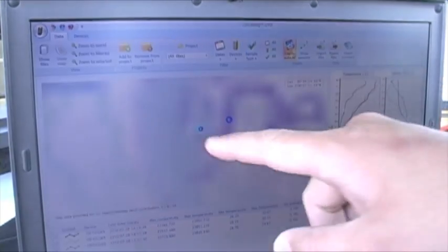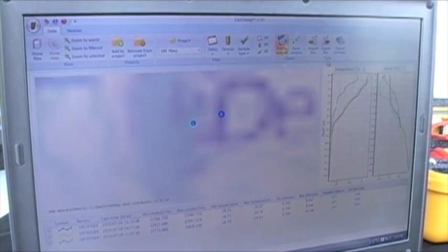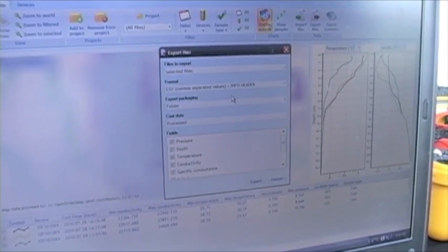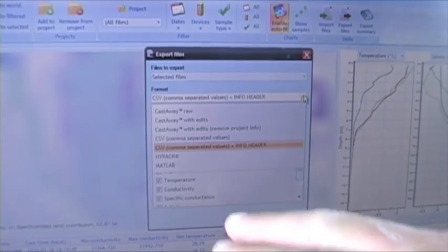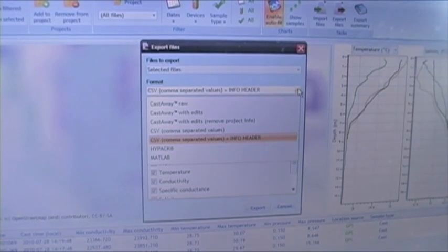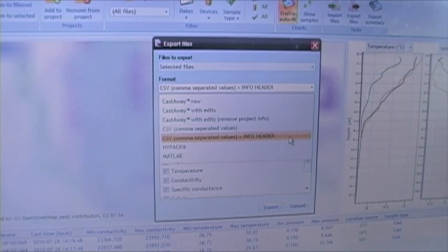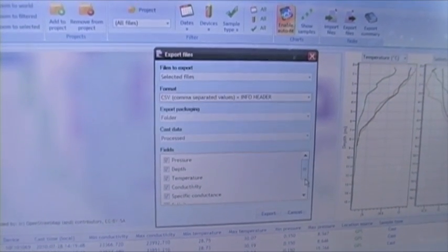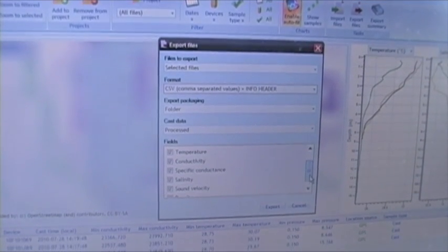Some of the real power in the software is exporting the data into a usable format. I can click on Export Files, and under Export I have a variety of options: comma-separated value, a HyPack option, a MATLAB option, as well as a Castaway option if you want to bring the data back into Castaway. Most people are going to do the comma-separated values with the info header, which gives them the starting lat/long and ending lat/long position. You can select which parameters you want to export: pressure, depth, temperature, conductivity, specific conductance, salinity, sound velocity, and density — and export all of that to a file.